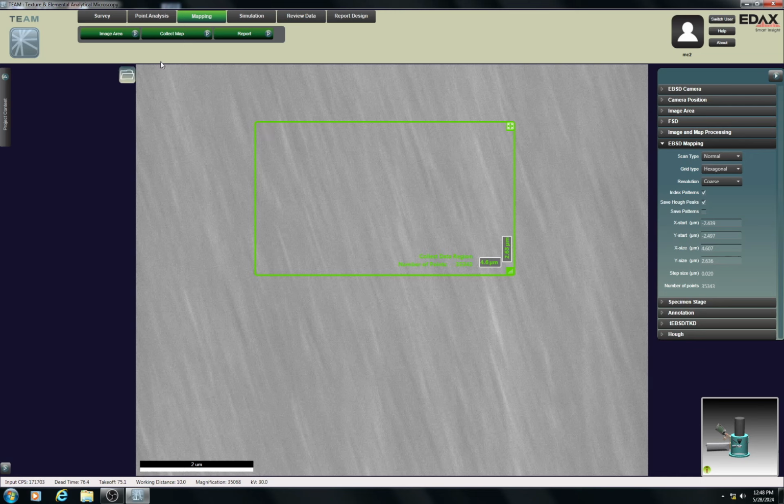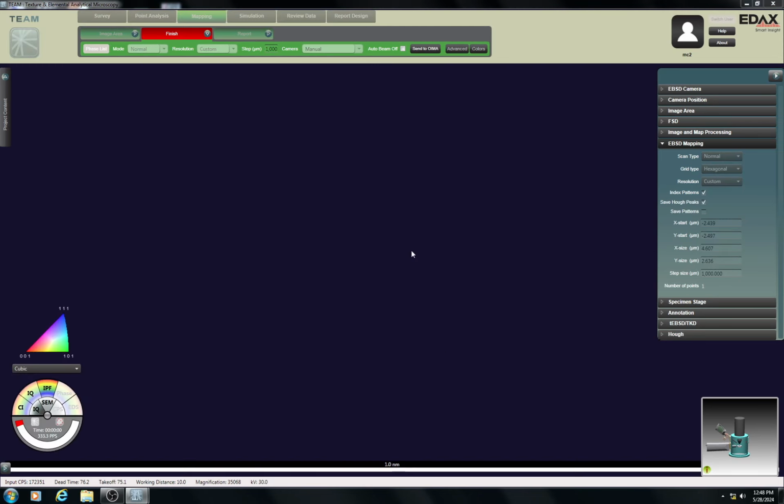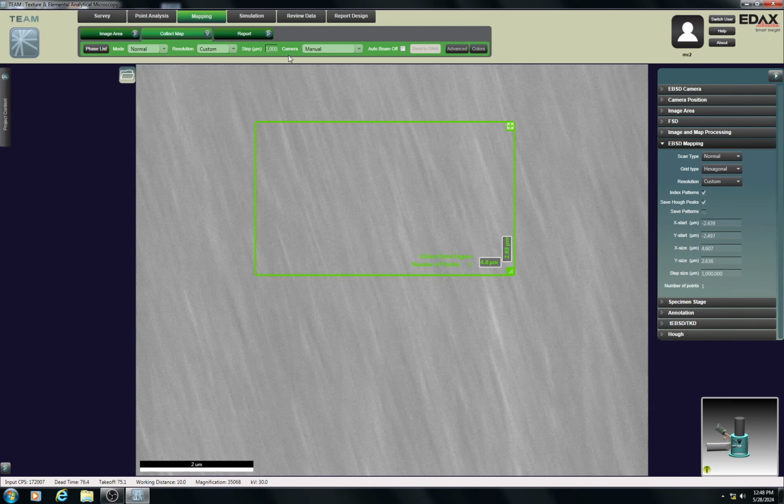back and forth. Here I can show you. Let me do a custom map, and we'll do a really big size. Let's do like 20 micron. Or no, that's going to be too big. Let me do 1 micron. I think that'll show it. Oop, no, it did not. Oop, I did 1,000.